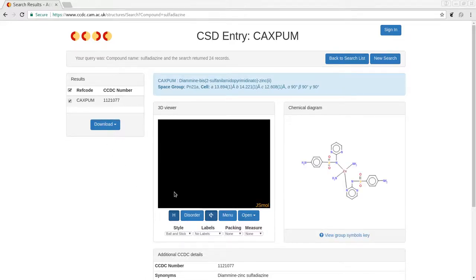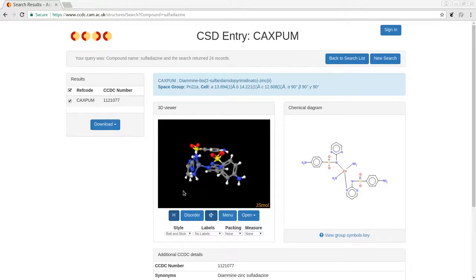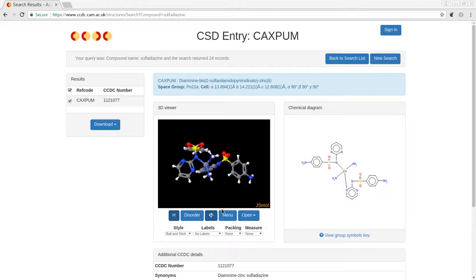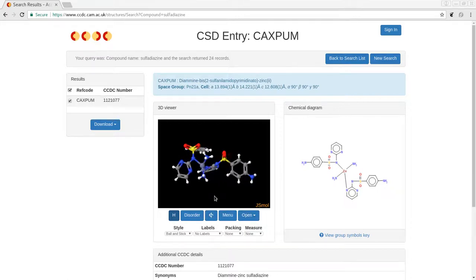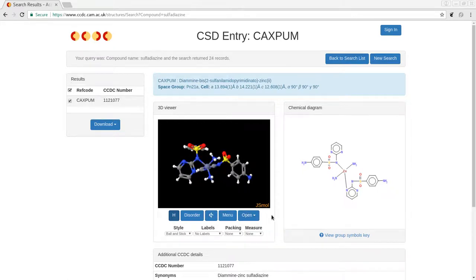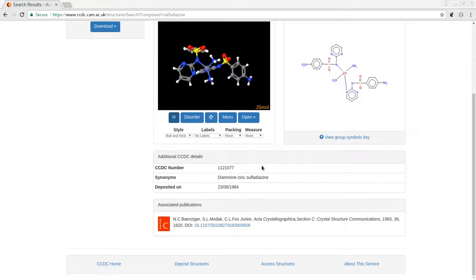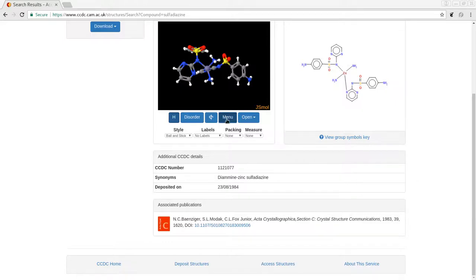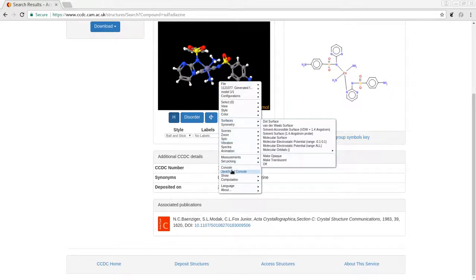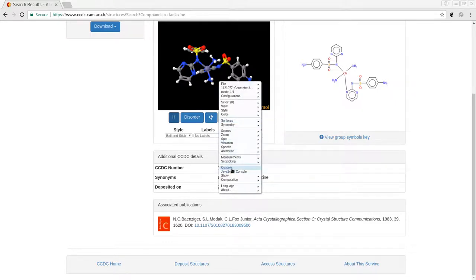And we're going to use console commands to make some modifications to the structure so that it can be more easily 3D printed. So in order to get to the console, we're going to have to go to the menu, which is down here. Takes a second to open up. But we'll open up the console.